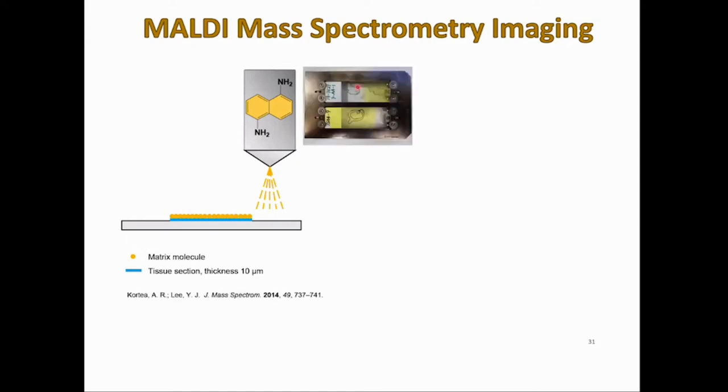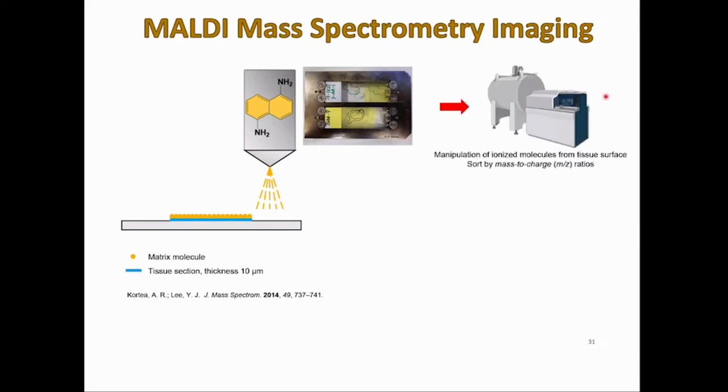And this is what the slides look like, and you have the tissues. It's hard to see, but these are the outlines of some tissues. This is for a different study, not for the TBI study. They're mounted on a stainless steel adapter, and that's what goes into the spectrometer. The spectrometers can be very fancy. This is one of our fanciest ones. It has a very large magnet, a 12 Tesla magnet. And we mount the sample in the ion source.